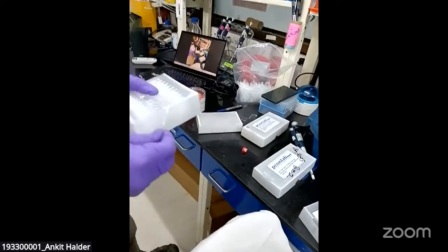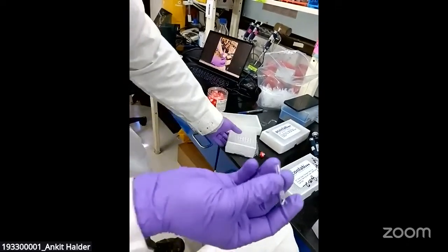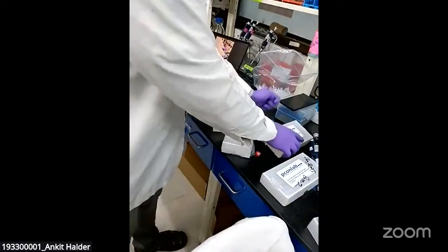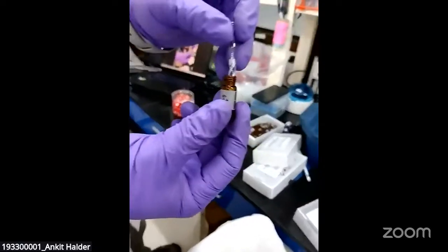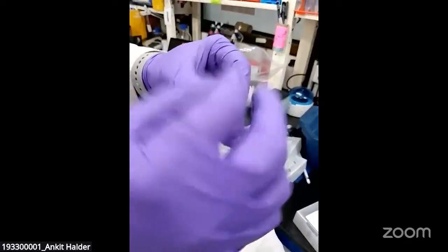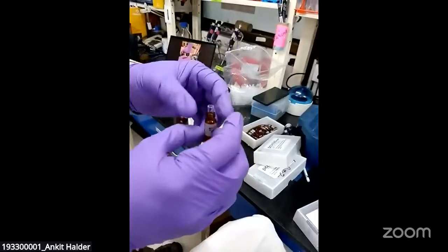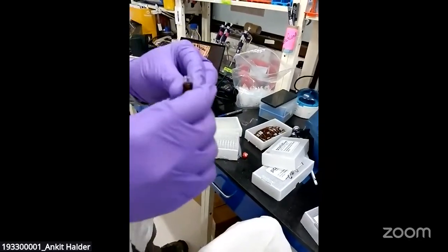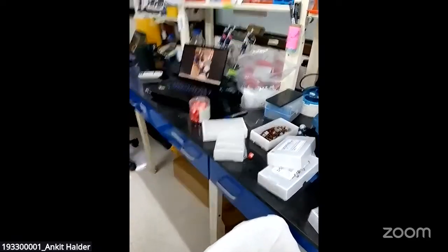Another thing is that these are the inserts. Whenever you are giving the samples to the mass spec via vials, you need to keep the inserts here. You put the samples in a vial and close the cap. Then you can just give this vial to the autosampler. Let me take you to the mass facility, where I can show you what actually the sample is.